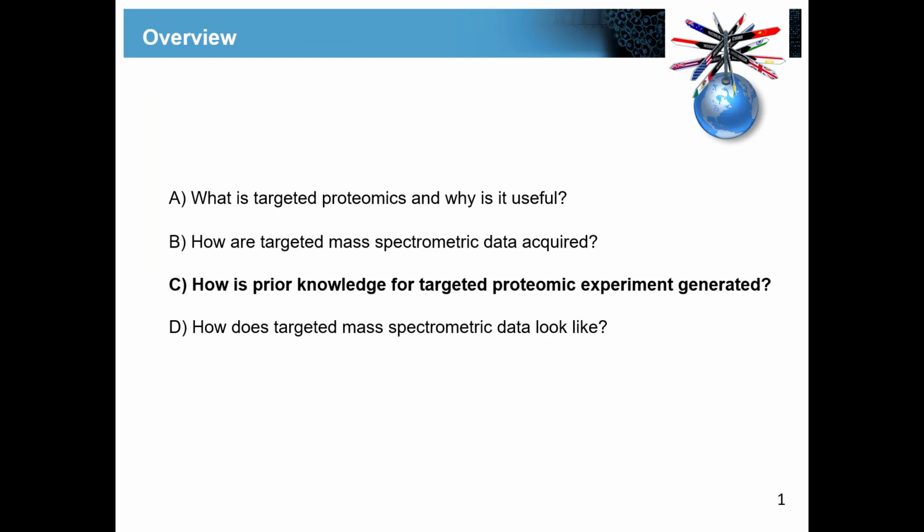Are there any more questions how SRM works? What the mass spectrometer does in an SRM measurement?